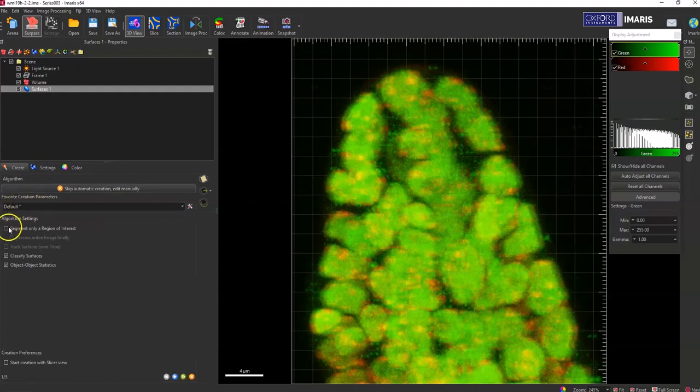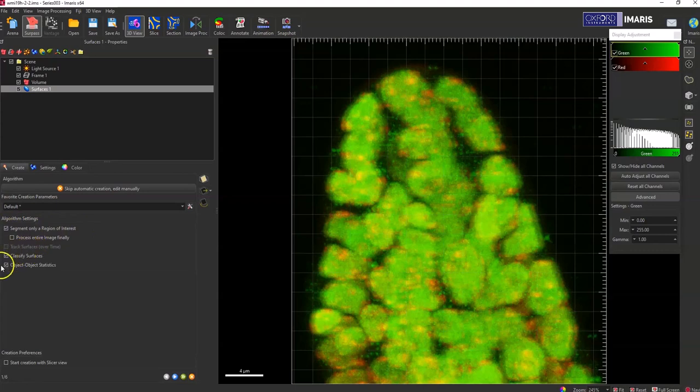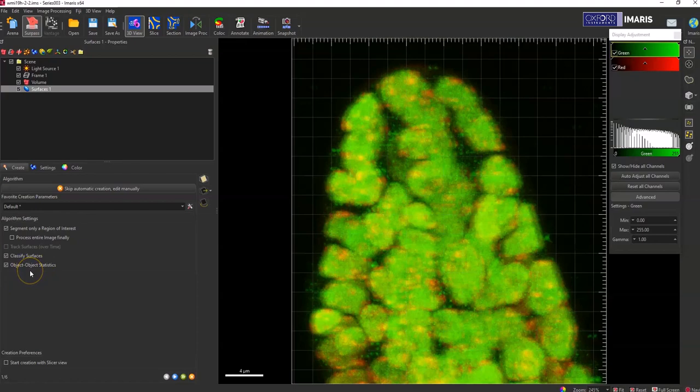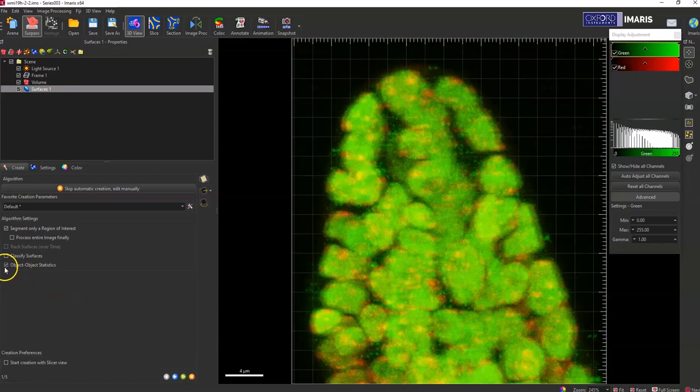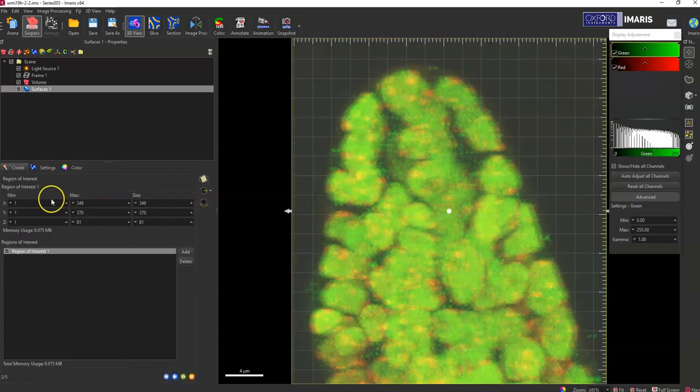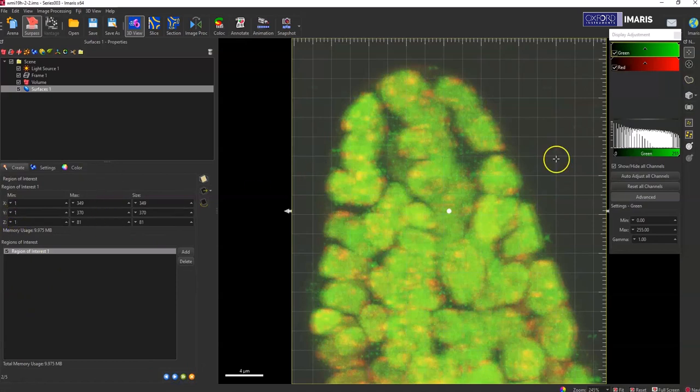Then select, this is the important part, to segment only a region of interest. You can classify your surfaces or do object statistics, whatever you would like to do for the actual batch process. You want to do it at this step. Just for the ease of this little video I'm just going to turn off that.